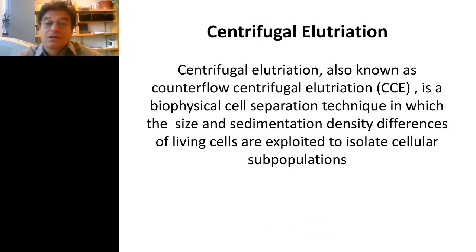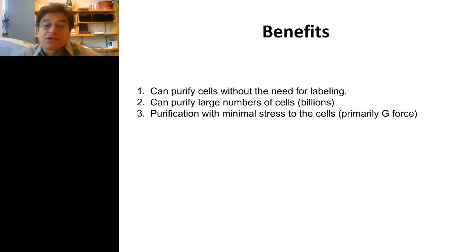Okay, next. Okay, so centrifugal elutriation, as Randy mentioned, is also known as counterflow centrifugal elutriation. It's a biophysical cell separation technique in which the size and... I'm sorry, one second, guys. Got it. I had something on my screen. The system uses sedimentation density differences in living cells as a means of purification and for isolating cellular subpopulations.